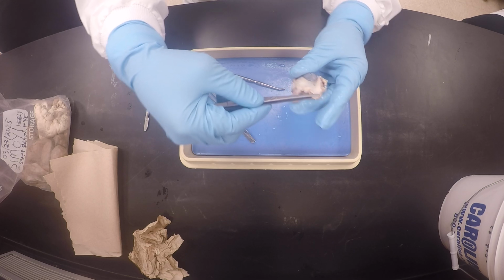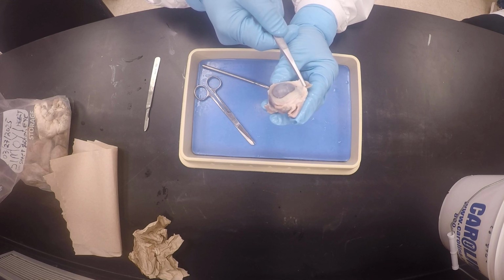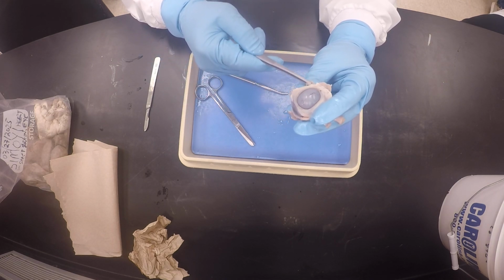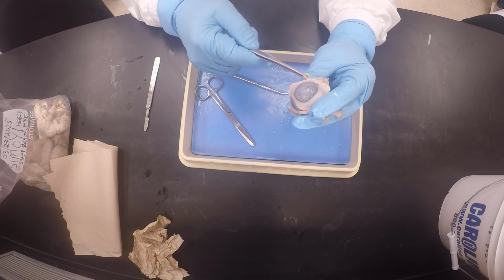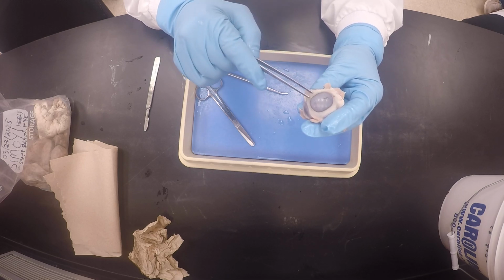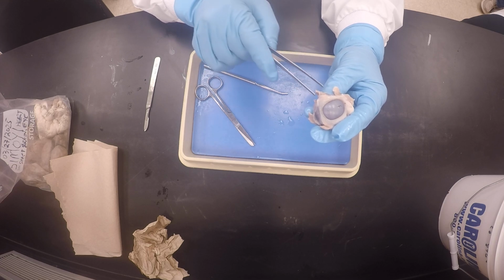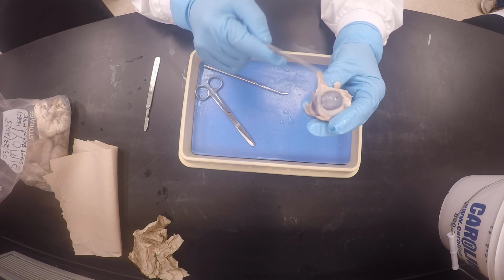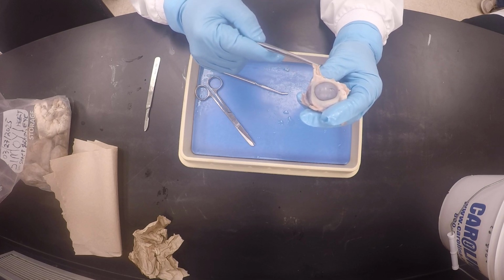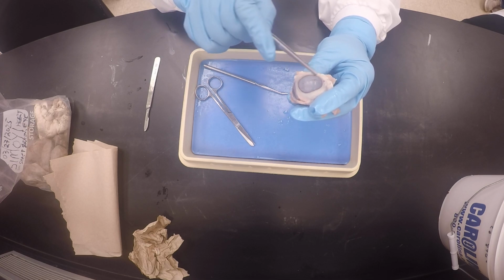One on the compass point, which is the lateral rectus, and then one that is going down, which is the inferior oblique, and it's pointing towards one of the long sides. That long side would be the inferior rectus, and you will know because you only have one on the compass point. It got a little bit pulverized, but it's nevertheless still there. So this is the inferior rectus for sure. So this is the inferior side.